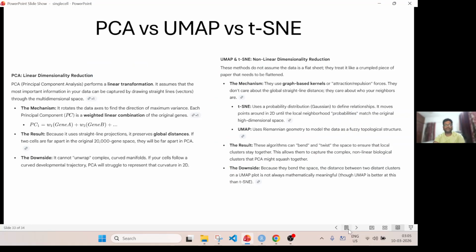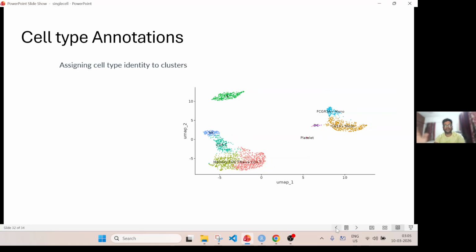So that's all about this. I think this is a very old slide. Yeah, I think that's all I had here.